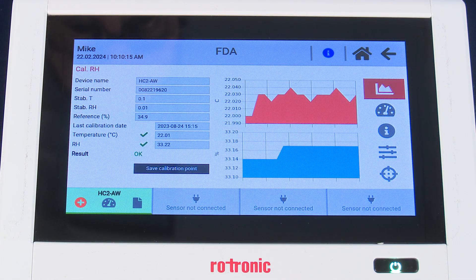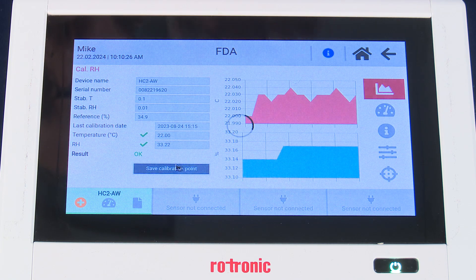Once the measurement has completed, you will see next to the result an OK, RH will have a check mark, and temperature will have a check mark. What we now want to do is save the calibration point.